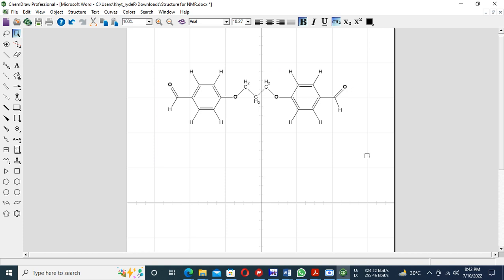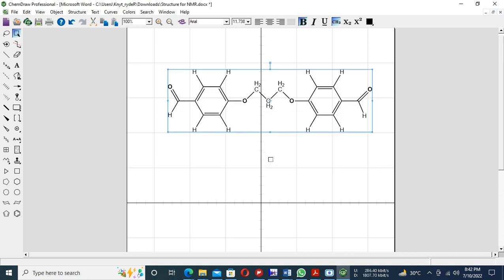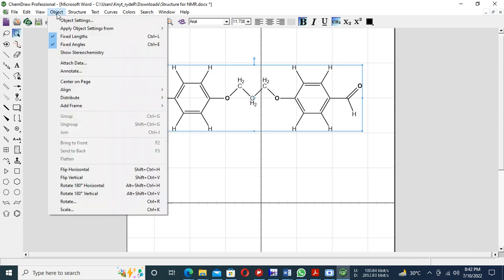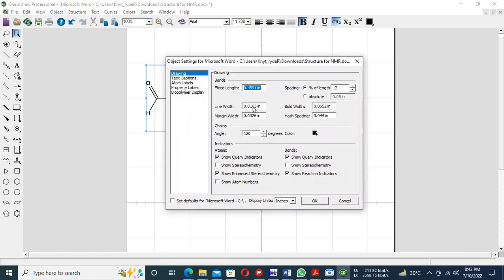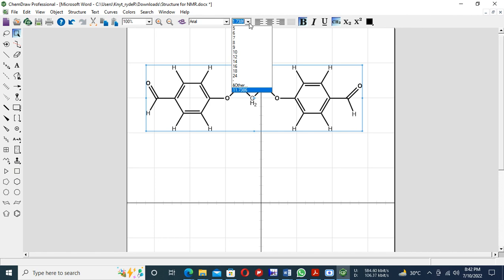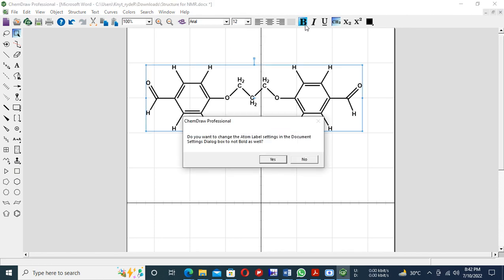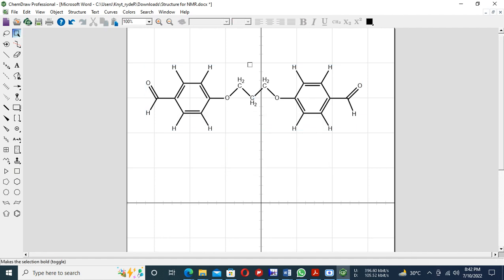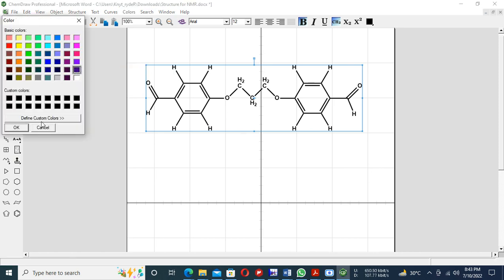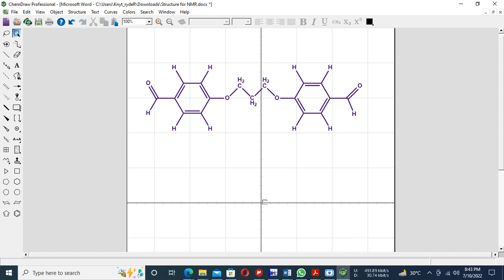Let me make it bigger. Okay, we're done. Now look here.